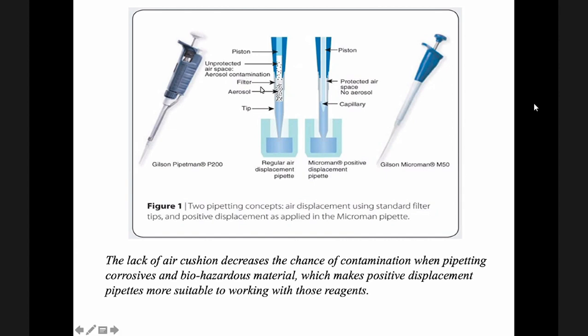Okay, so this is a closer look. We have here the regular air displacement pipette. We have your pipette tip, the airspace here, then you have your filter.